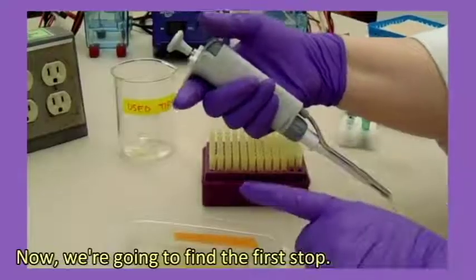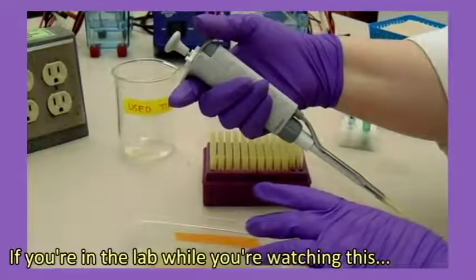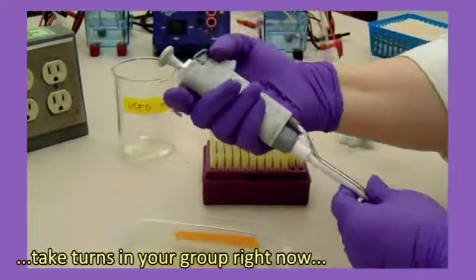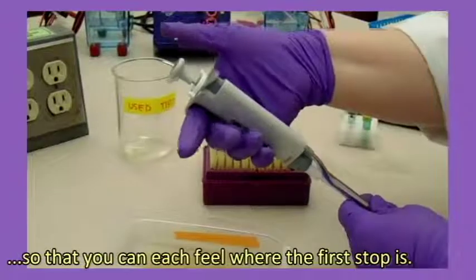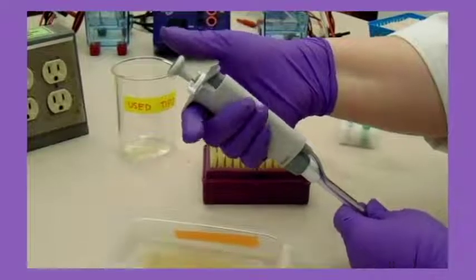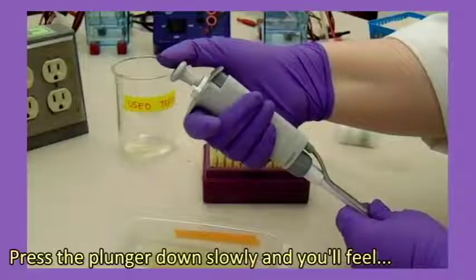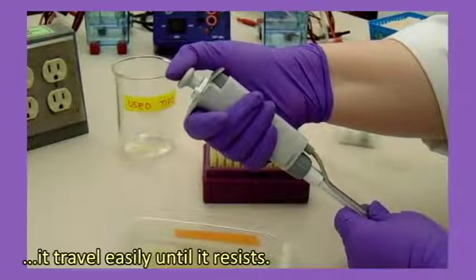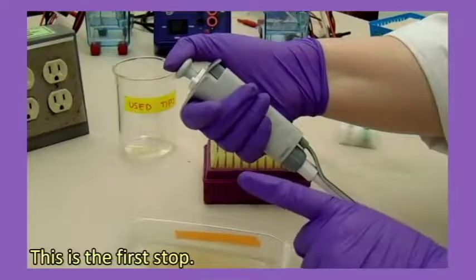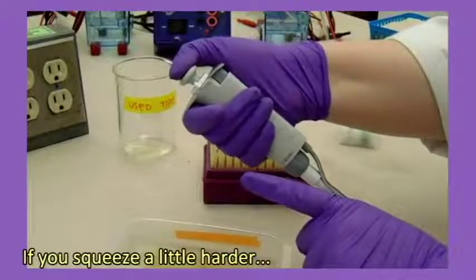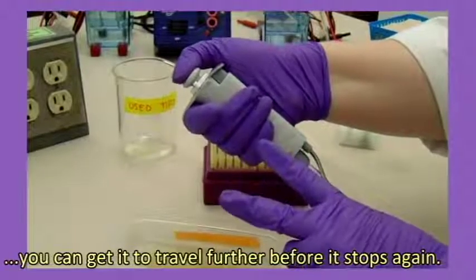Now we're going to find the first stop. If you're in the lab while you're watching this, take turns in your group right now so that you can each feel where the first stop is. Press the plunger down slowly and you'll feel it travel easily until it resists. This is the first stop. If you squeeze a little harder, you can get it to travel further before it stops again.